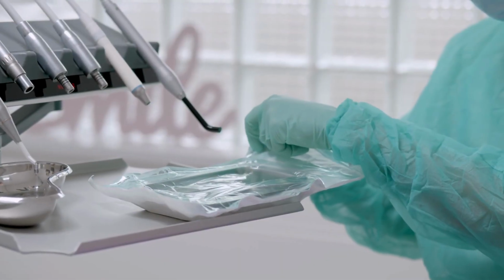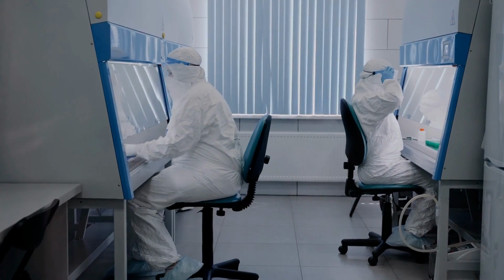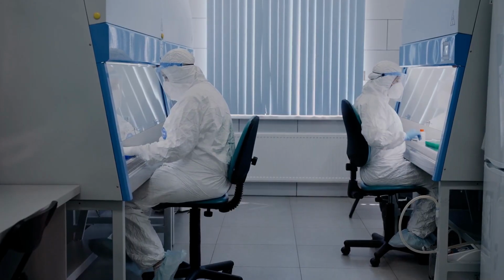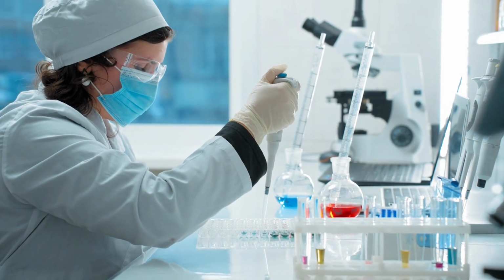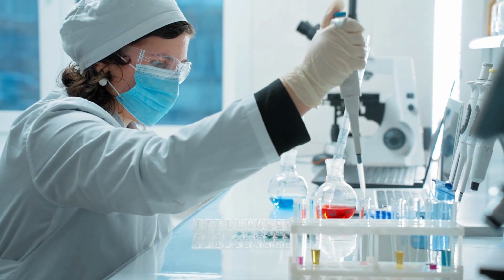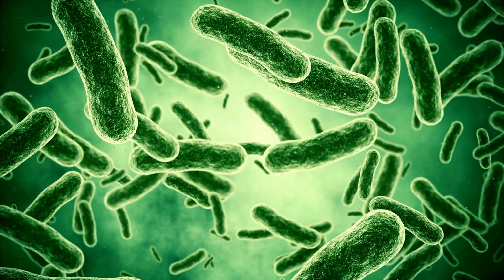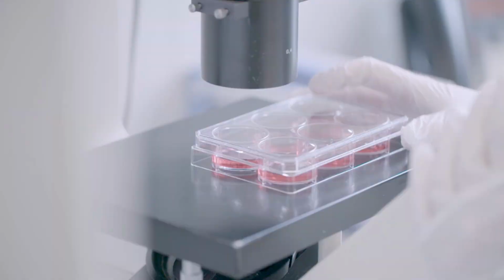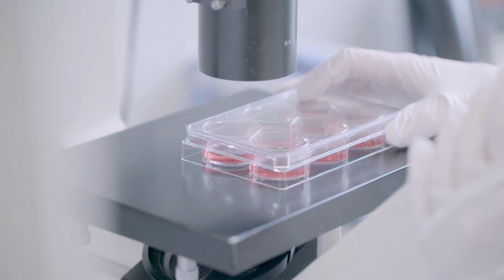One of the most important aspects of cell culture is aseptic technique. This means working in a biosafety cabinet, wearing gloves and lab coats, and using sterile tools and reagents. Surfaces and equipment should be properly disinfected before and after use. Following these practices helps prevent contamination from bacteria, fungi, and mycoplasma, and ensures both sample integrity and personal safety.